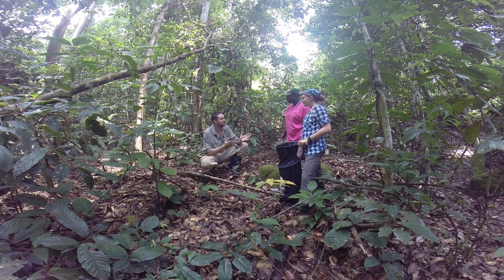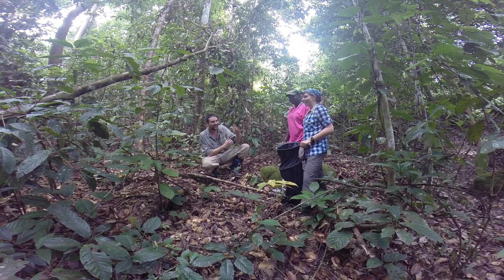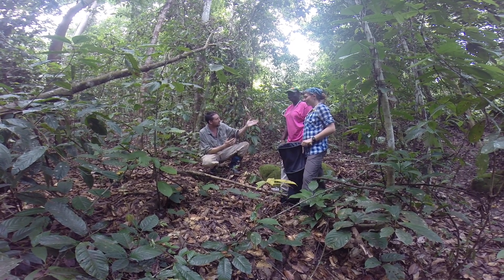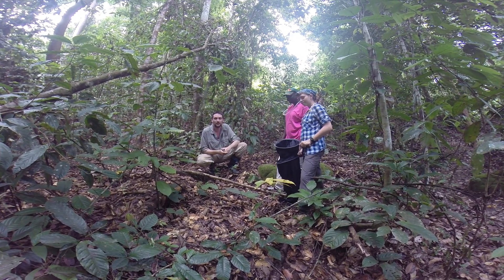We have two ant specialists with us today. We have Nicola from Scotland and Marie Madeleine from Senegal, and they're going to show us how to do a leaf litter extraction.